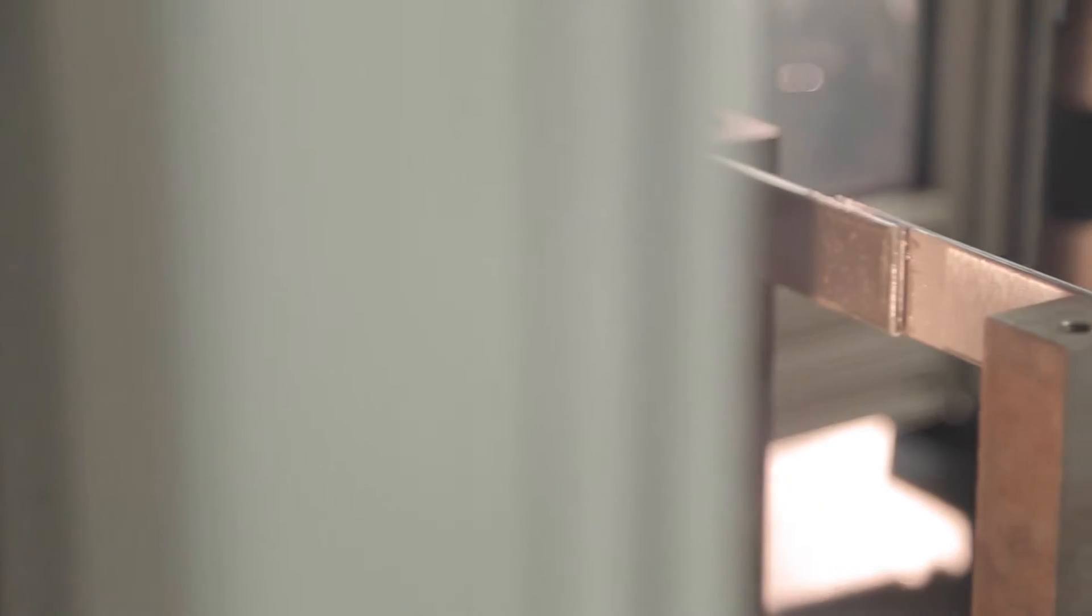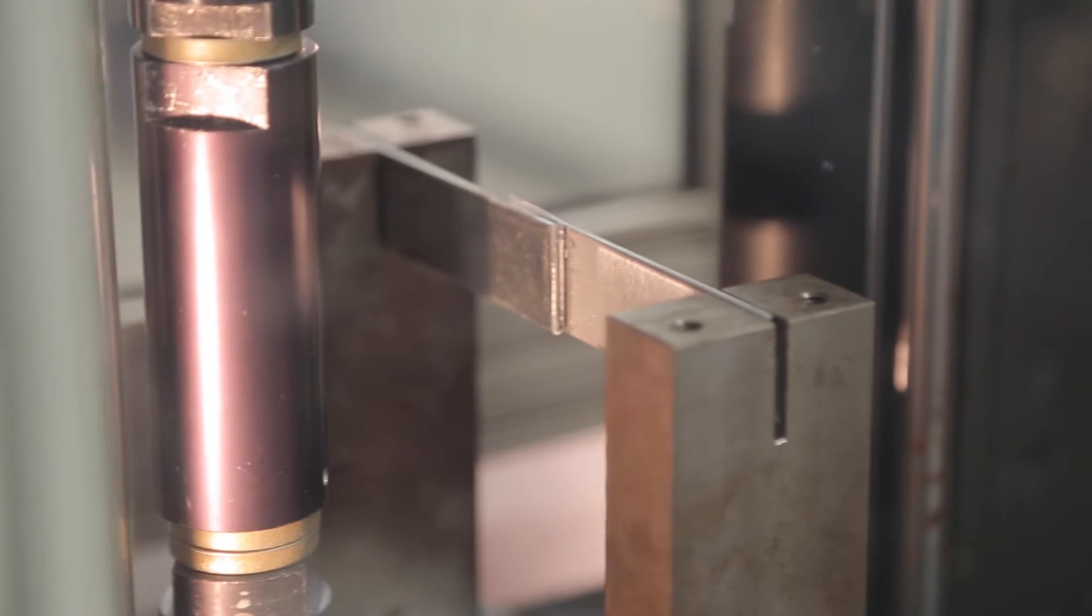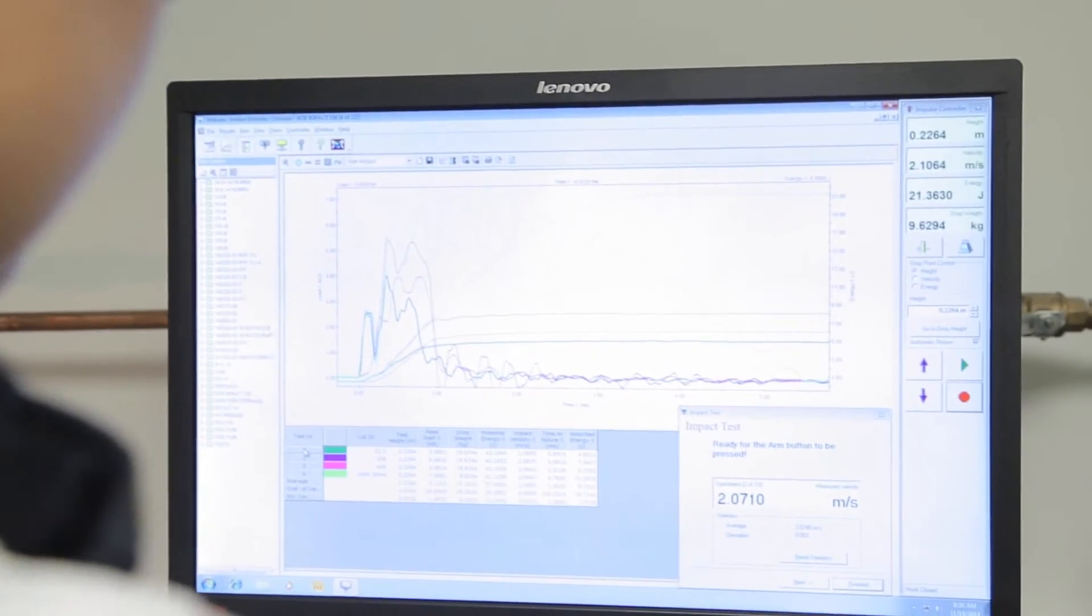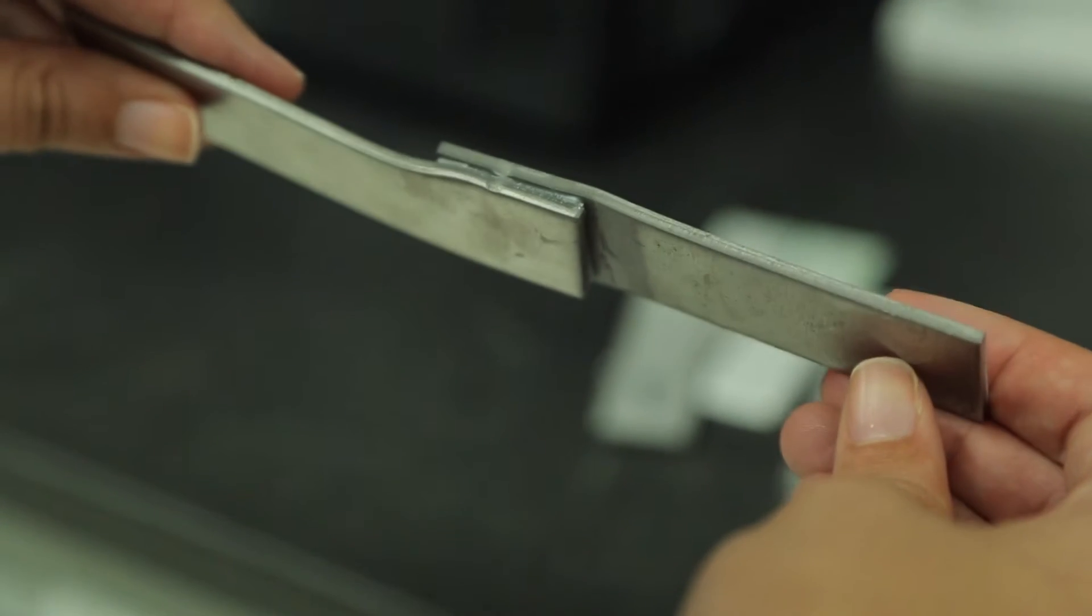One way to test for impact resistance is to drop a weight from a set height onto a bonded assembly and then record the absorbed energy. Did you know that nowadays, adhesives which in the past had low peel and impact strength can be toughened with elastomers, resulting in substantial improvement to these properties?